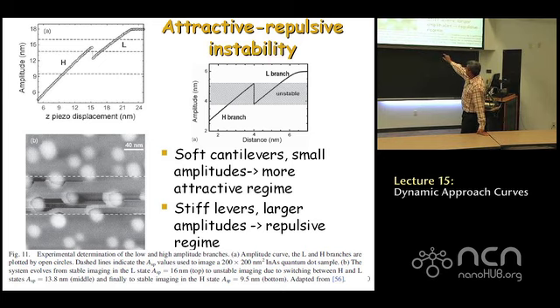The very bottom third is a topography image taken with 10 nanometer or 9.5 nanometer oscillation amplitude, which is net repulsive, and it has not switched during the imaging state. So you get a nice image. Do you see that there's a difference in image quality between the top third and the bottom third? Which do you think is sharper? Top third or bottom third? Bottom third is a little sharper.